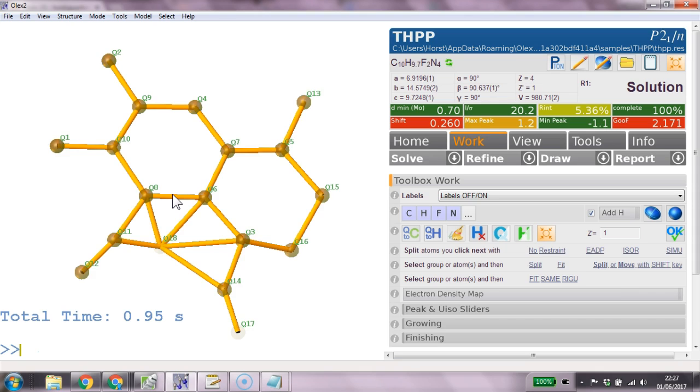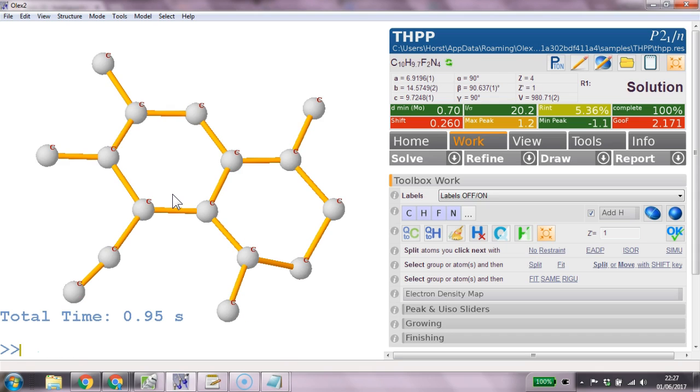At this point the best thing to do is probably to type CLEAN. So CLEAN deletes all the peaks that are clearly not correct and it makes everything else carbon. It's a very simple routine but it's often quite effective.